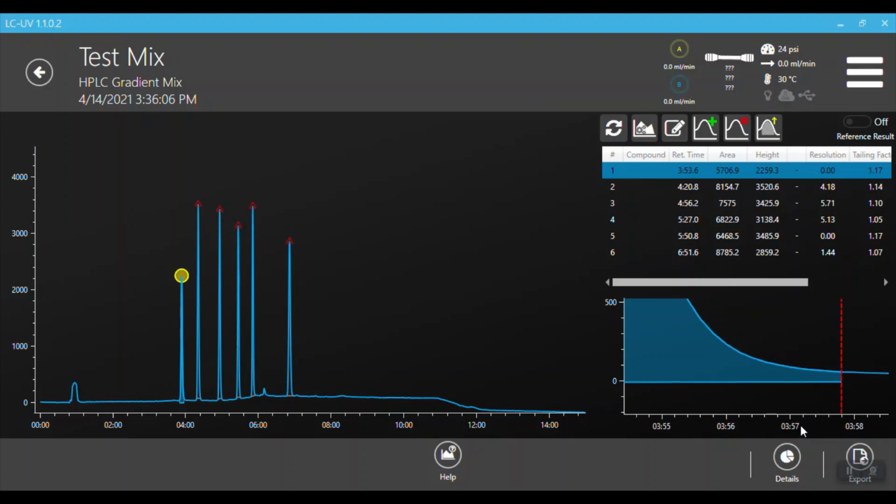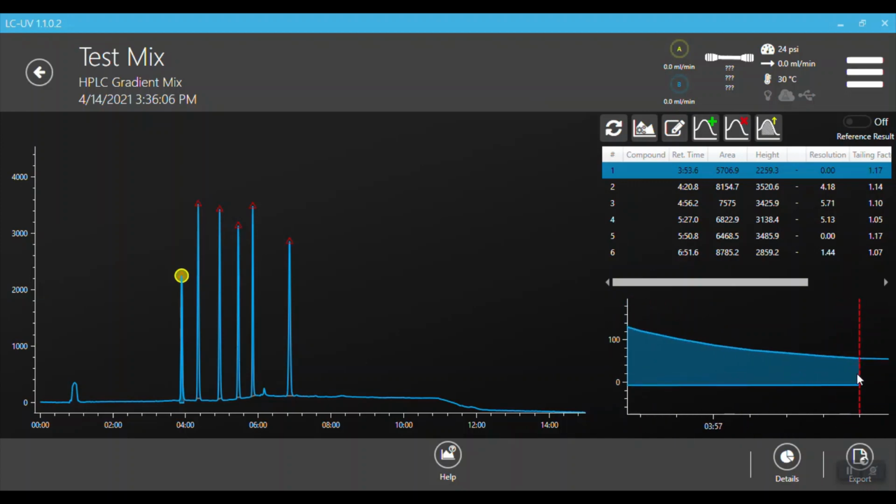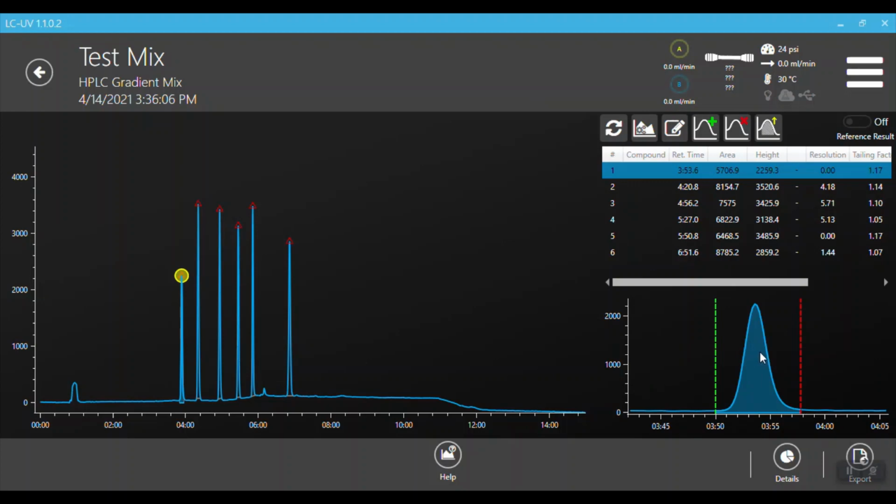You can also scroll in and out with the wheel on each of the axes, or you can hover over a point and it'll zoom in on that point. Right clicking will allow you to drag, and if you want to zoom back out, double click on the center wheel. You want to raise back up to baseline to go back to valley, you just click that button.